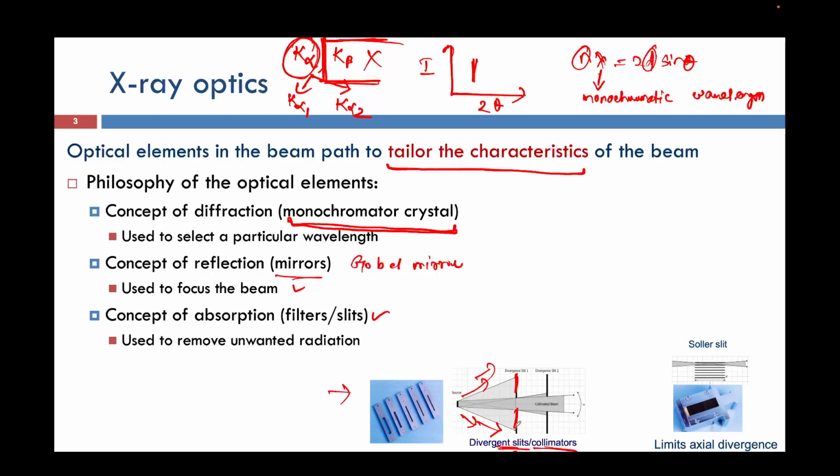The objective aperture, the condenser aperture. So we are stopping the unwanted electron beam in electron microscopy. A similar concept is also used here, so that our X-ray will follow this straight path. This is what is called a collimated beam. So how do we make a collimated beam? We make it using the slits.